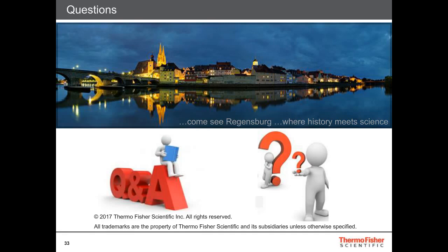Well, this is a question we get a lot, which I obviously cannot answer per se, because the yield of your protein always depends on the target productivity, and it also depends on the requested quality that you have as a customer.